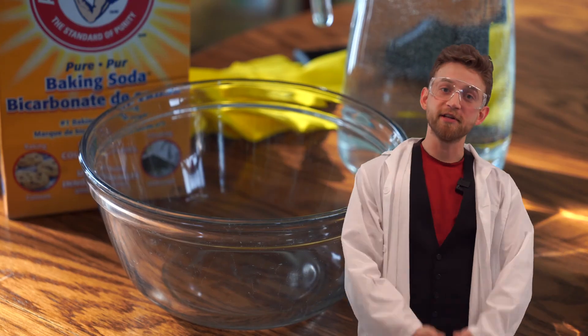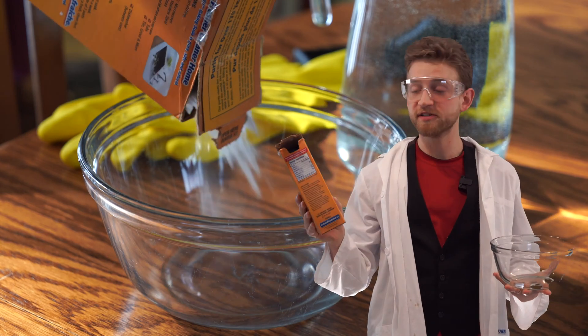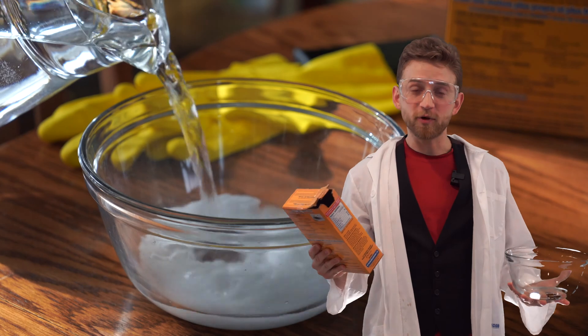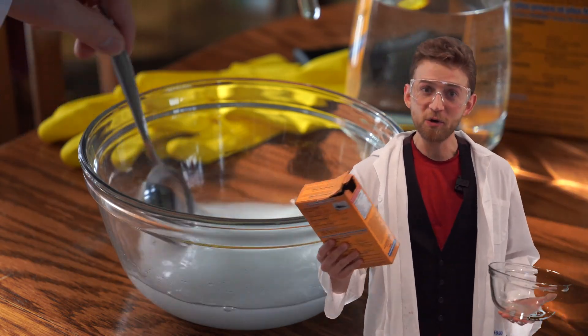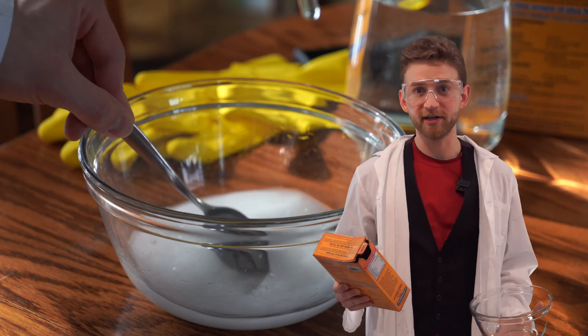As an extra level of safety, I'm going to mix up a bowl with a bunch of baking soda — sodium bicarbonate — which will neutralize the acid. Worst case scenario, if it gets on my skin and goes way farther than expected, I can just neutralize it. It's good to have this on hand when working with strong acids.